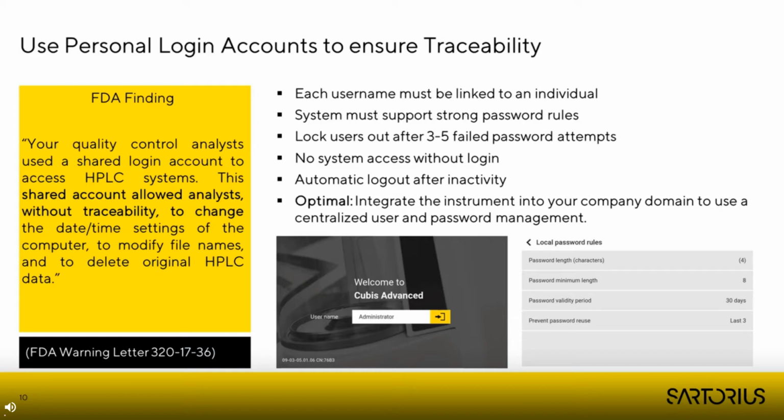Therefore, each user should work with their own personalized user account. It should be a unique account, and the instrument must have functionalities to prevent this account from being used by other users. This includes complex passwords, locking the account after too many wrong logins, or even the automatic logout after inactivity.